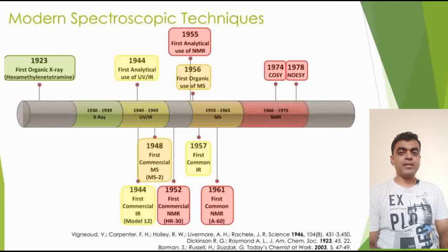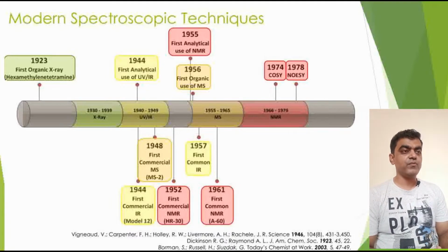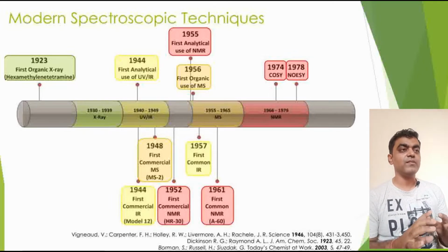Today we will be seeing NMR spectroscopy and how we are going to get the structural information from NMR spectroscopy data. We discussed 1D NMR spectroscopy, how we see the spectra, what the spectra pattern would be like, what the spin-spin coupling is, the chemical shift positioning, and what factors affect or influence the chemical shift positioning with respect to the reference you are using.